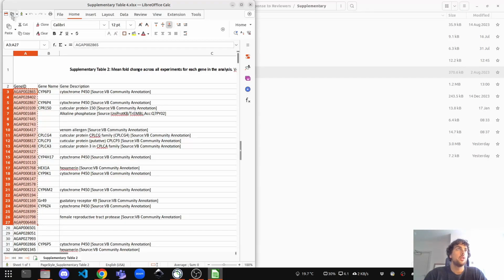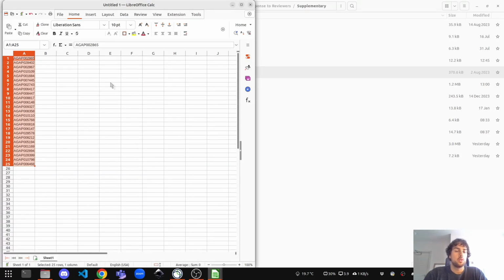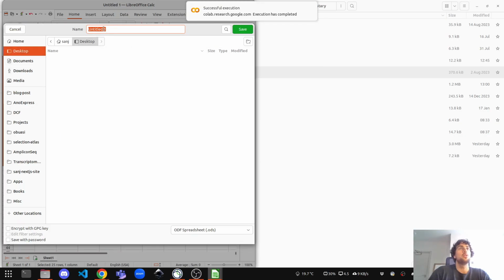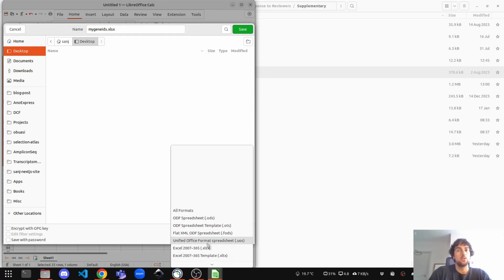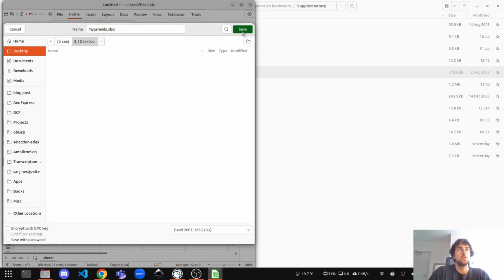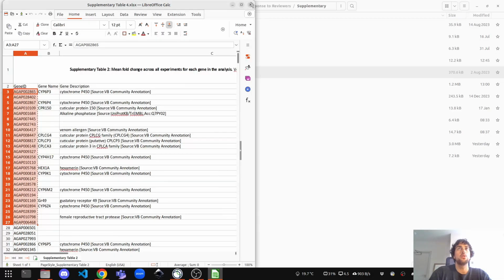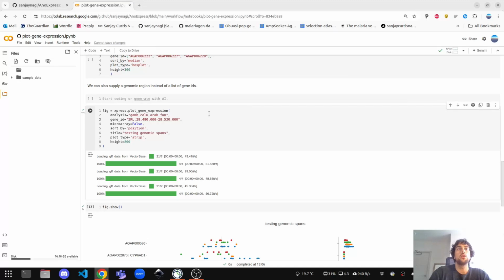So let's take these genes, and let's save that onto our desktop and call it my gene IDs dot xlsx. Okay, saved, and let's quit that.